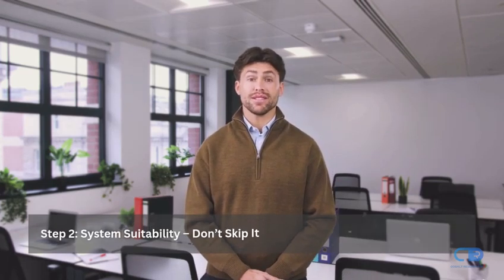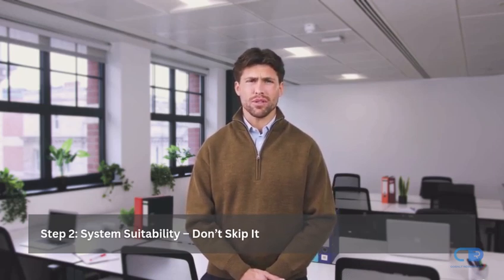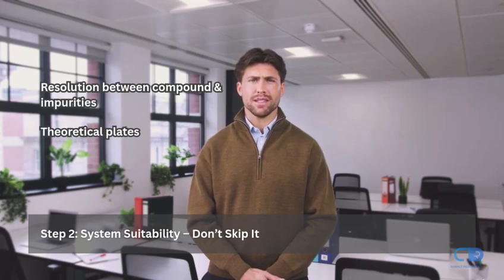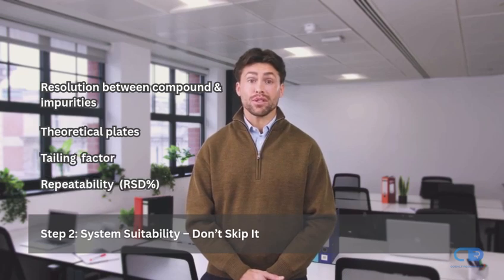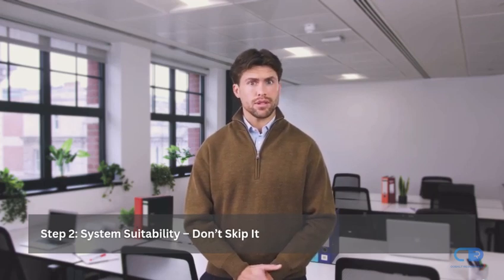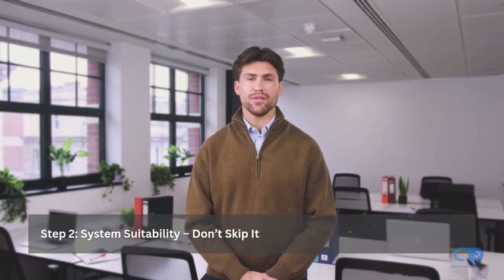Step 2. System suitability. Before any actual testing begins, you must confirm the system is working correctly. We do this through system suitability tests, such as resolution between compound and impurities, theoretical plates, tailing factor, repeatability, RSD%. If these values fall outside the acceptable range, it signals a problem with the column, mobile phase, or instrument, and it must be resolved before continuing. Skipping this step can produce misleading results, even if the data looks fine.